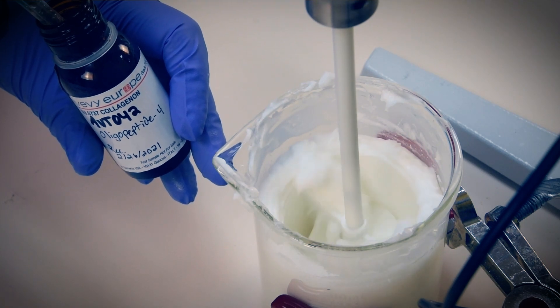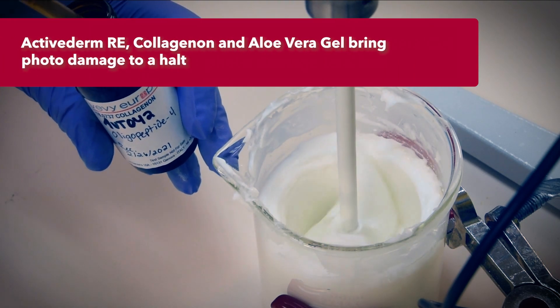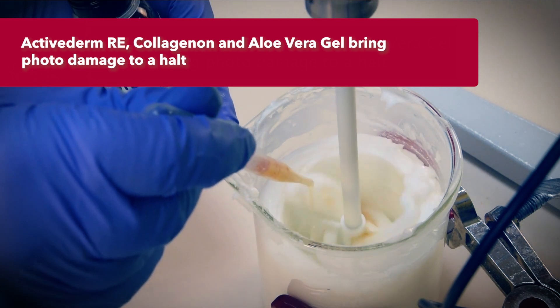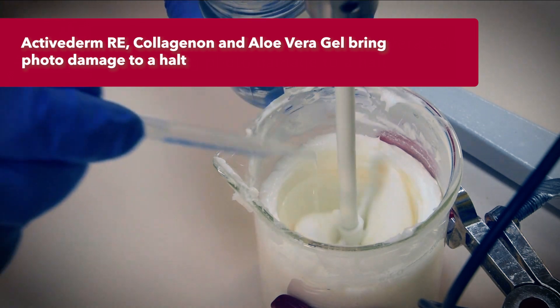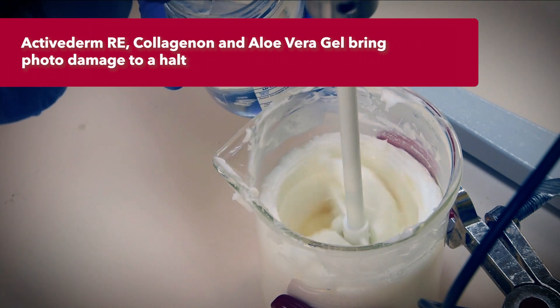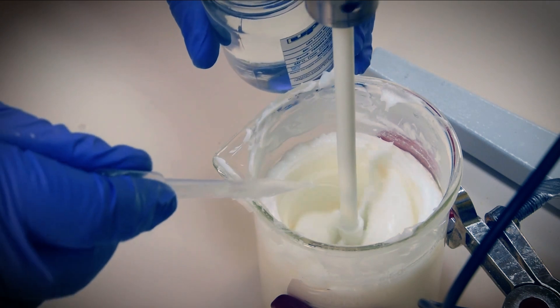Looking good at 40–45°C — just a few more additions. First is Collagenon from Vevy Europe, a reconstructive oligopeptide for clean beauty skin care. Then we'll add a nice dose of aloe vera leaf gel for its anti-inflammatory properties. The two remaining elements are the preservative and the fragrance.